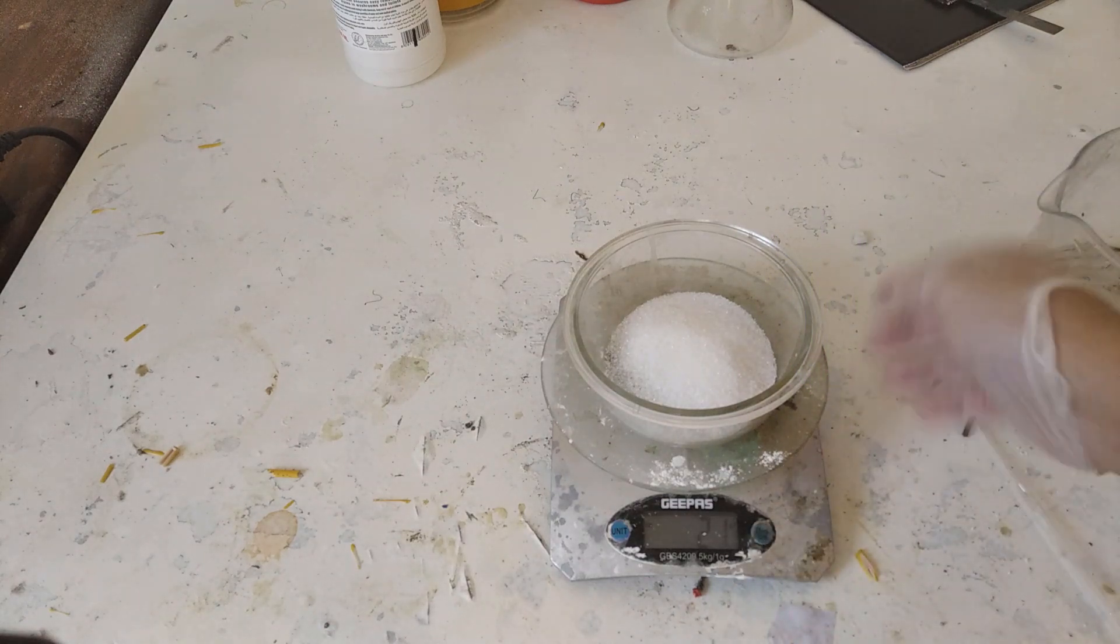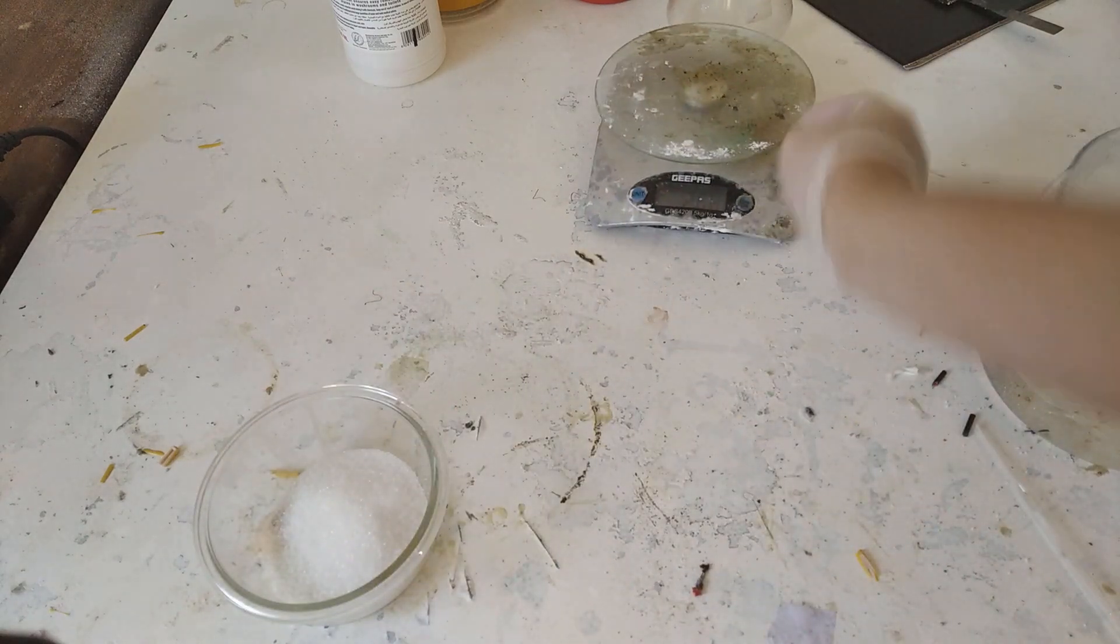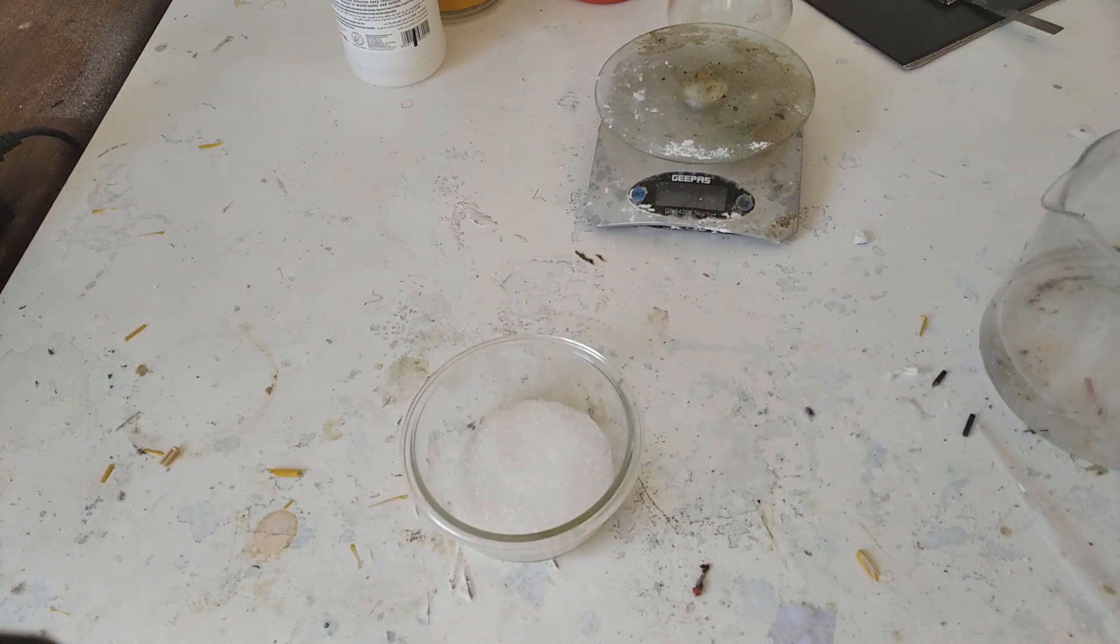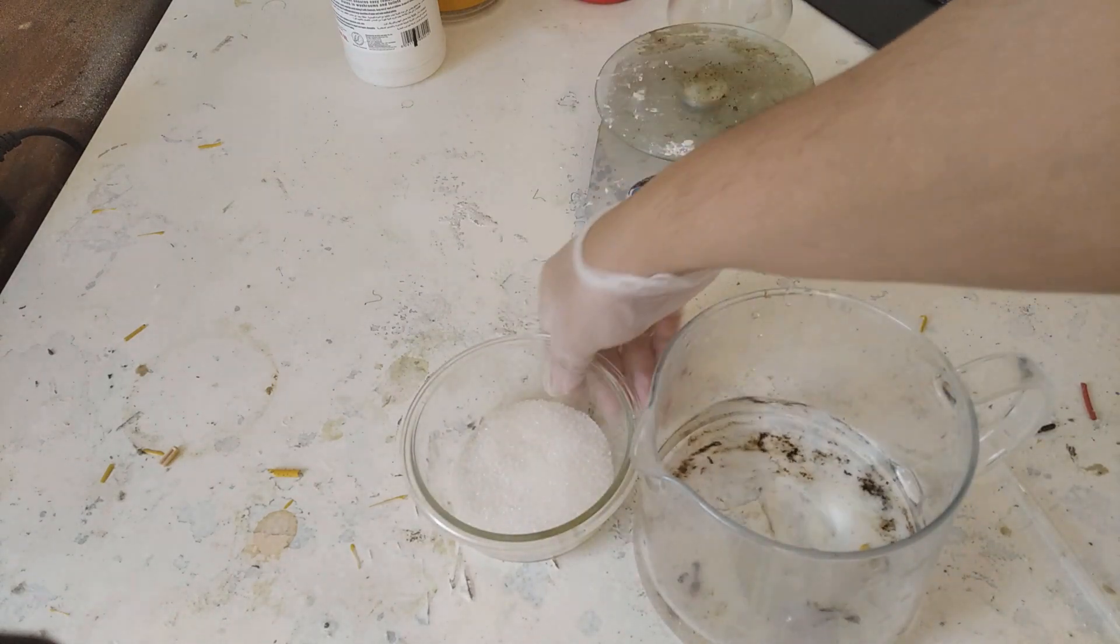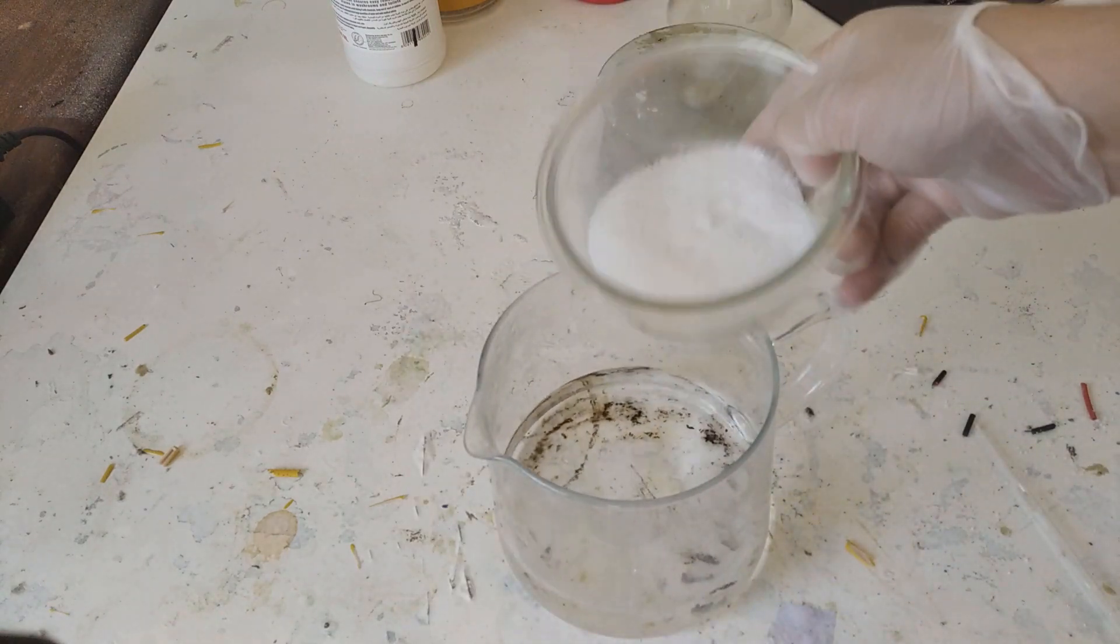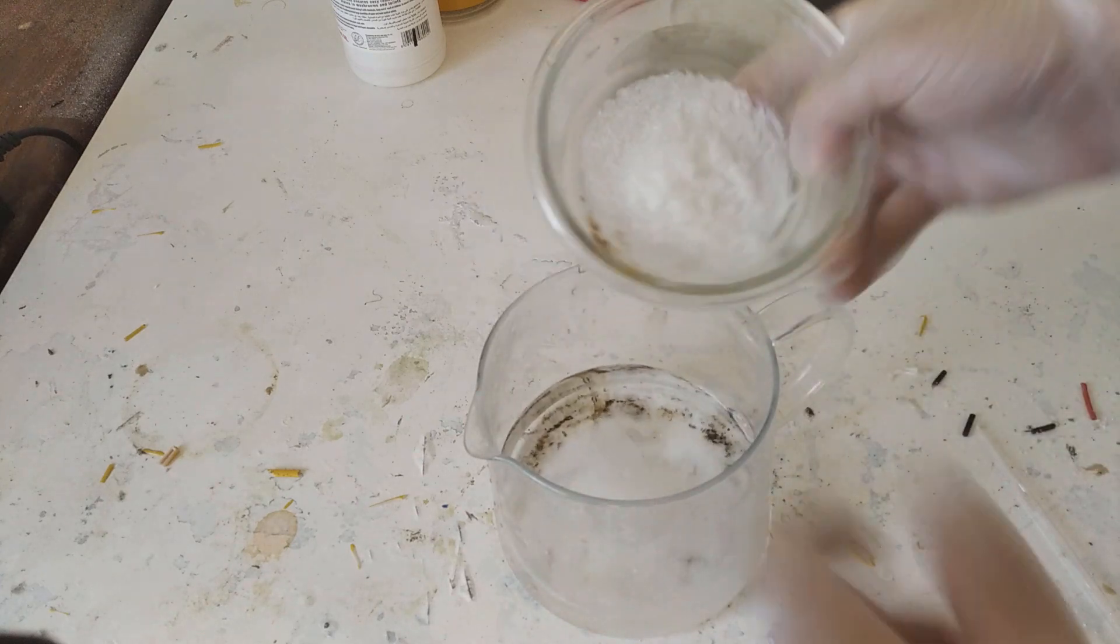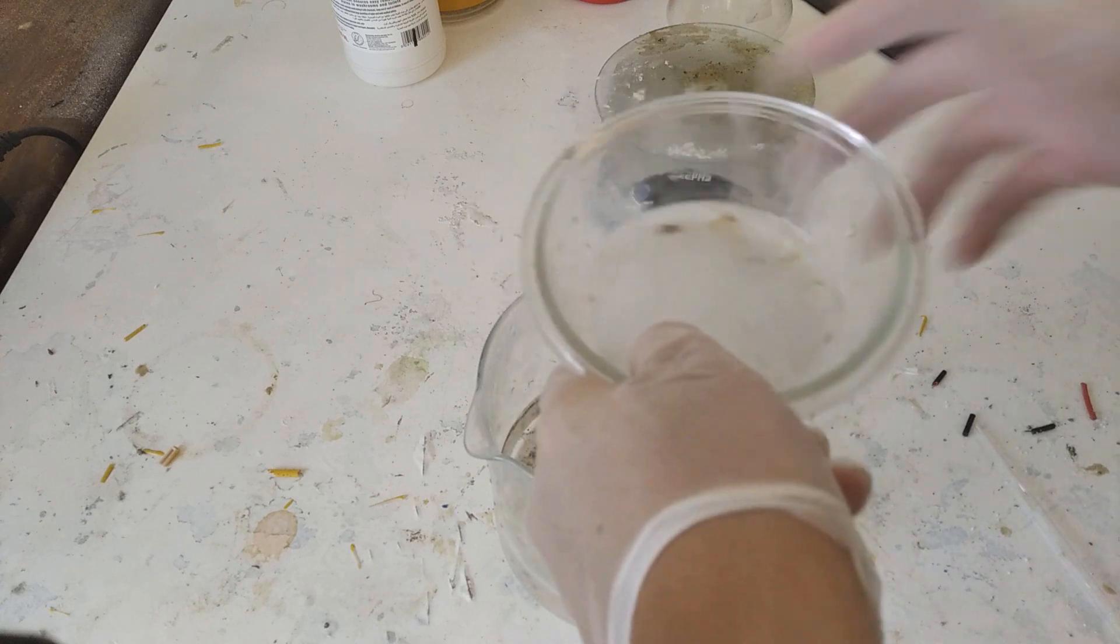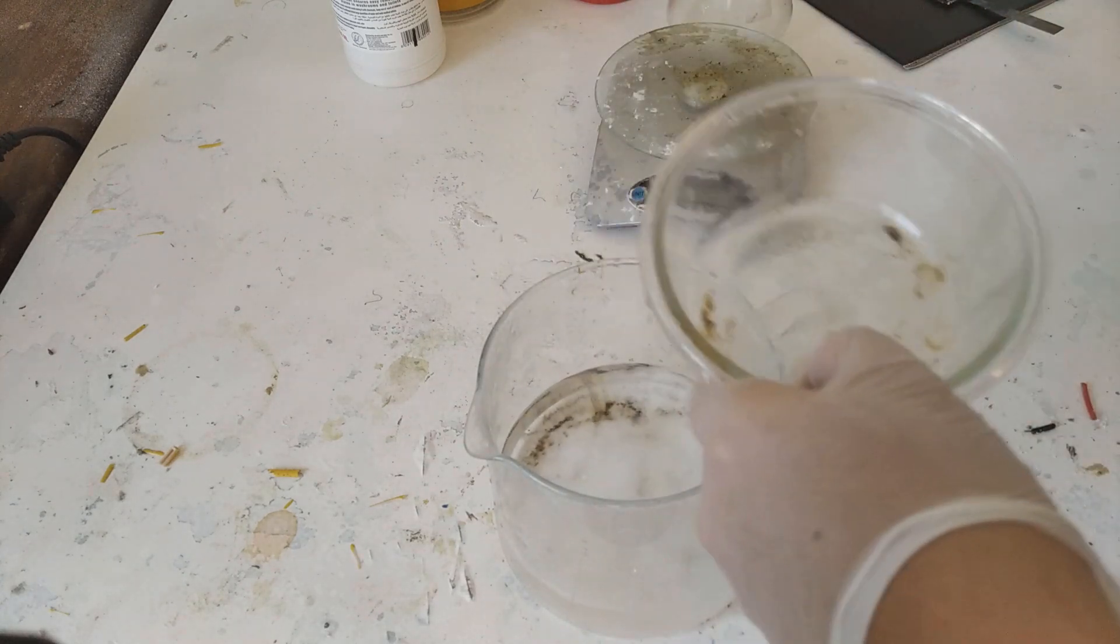The next step we gotta do is we then need to put this into some warm water over here. I was gonna put it in here but I realized it might not be enough. So we're just gonna try our best to just dump these two in here as quick as possible because this reaction is very quick. I have some more water on the side because I knew this would happen.